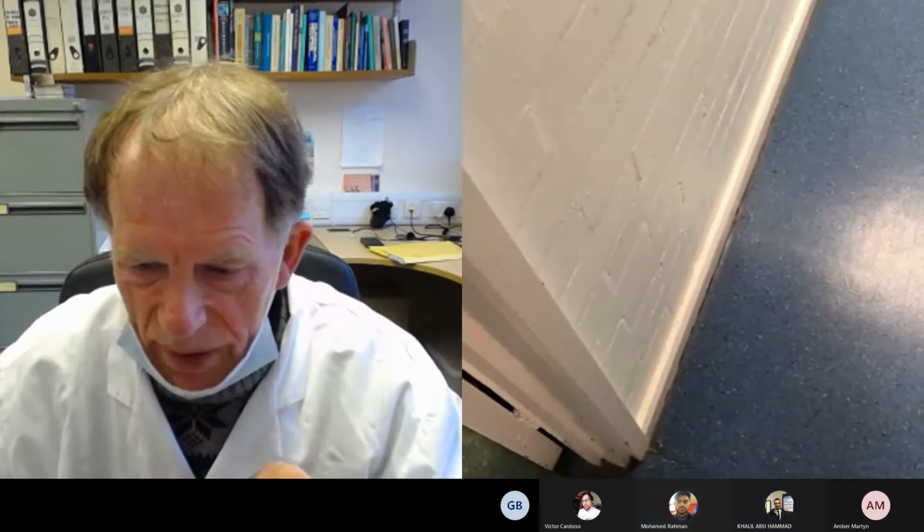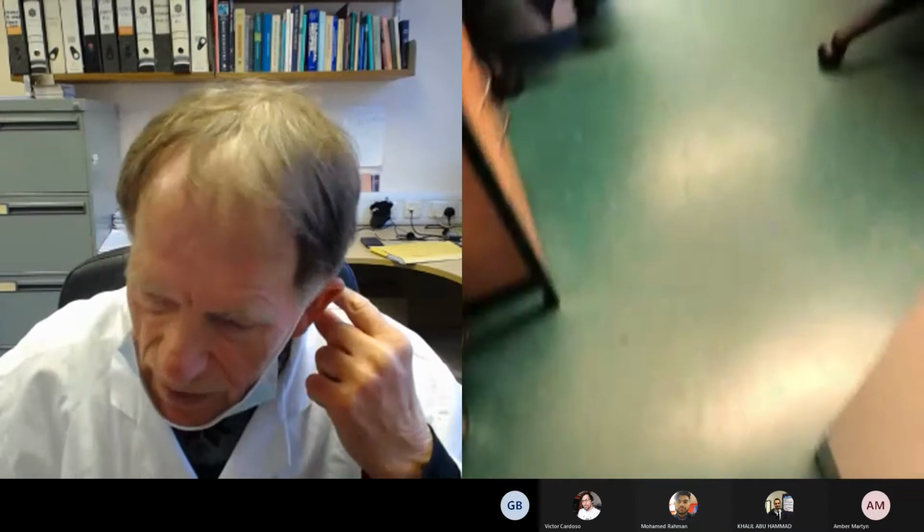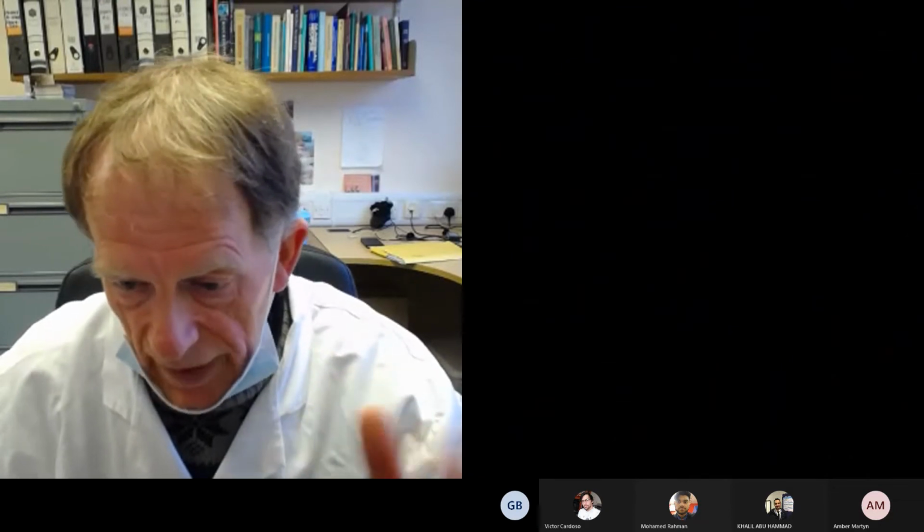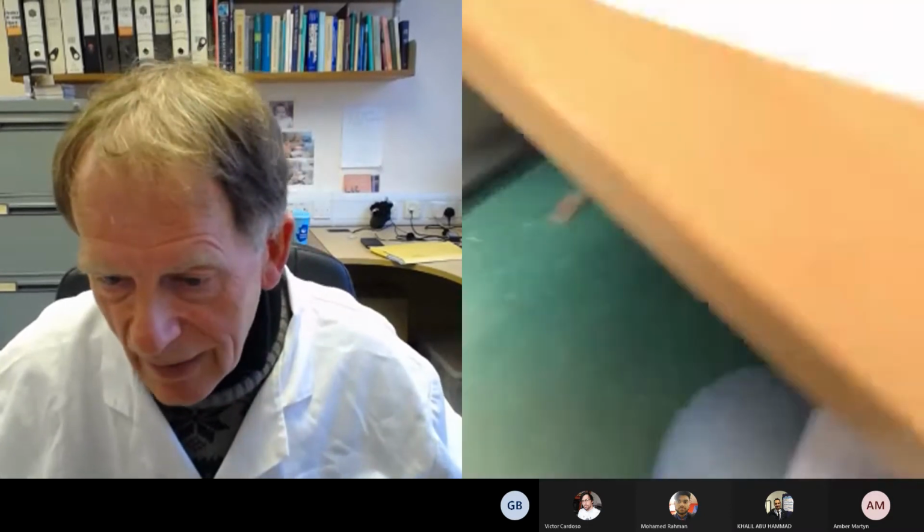Well, we'll soon find out if you got that, because in the assessed questions, I think the first two involve some sort of calculations like that, and one's involving a dilution. So we'll find out if you've understood it. But just ask any questions if you didn't understand what we were doing there. And the important thing is 280 nanometers is the wavelength, not the extinction coefficient. We work at 280 nanometers because that's where all proteins absorb, as long as they have aromatic residues like tyrosines and tryptophans.